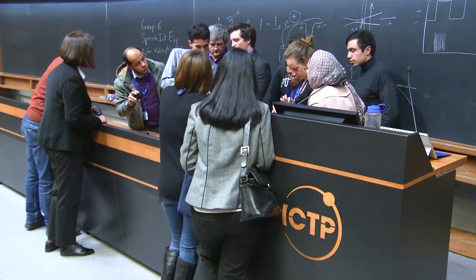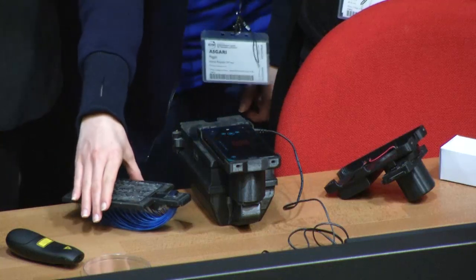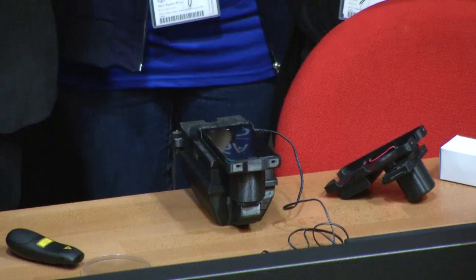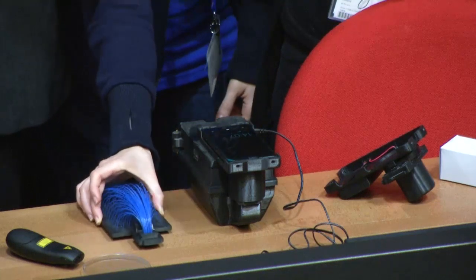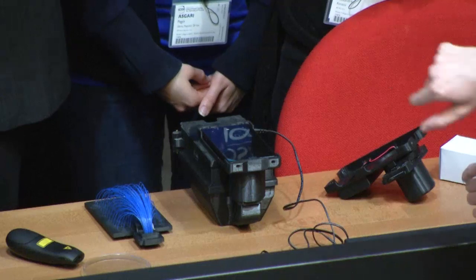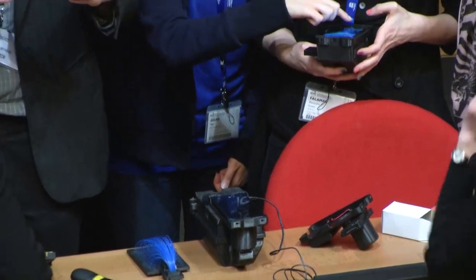Sure, this is a plasmonic reader I developed. It has an image sensor at the bottom, and a cone that guides the light down to an aperture, which then shines the light onto the image sensor. You then would take a plasmonic sensor, where the sample would be dropped on with a cover slip, and the surface is functionalized to selectively capture an analyte.